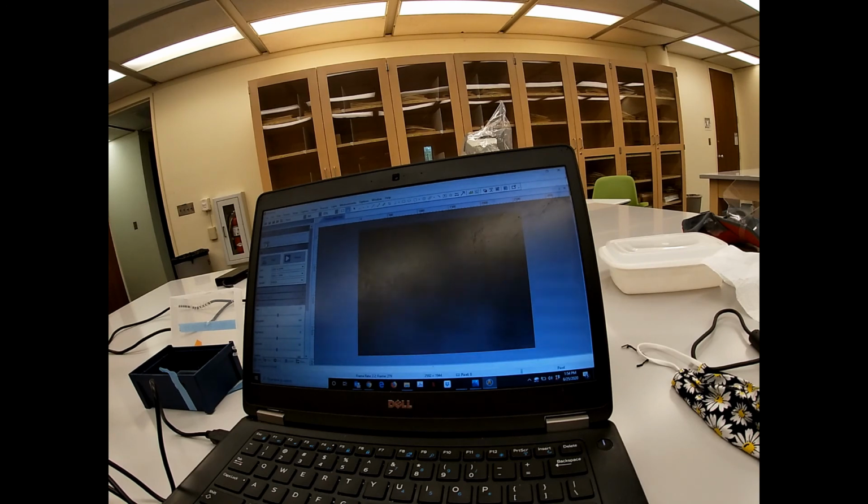I've just rotated the objective lens to the 40x, and we're going to let that come into focus. The camera's working. You're going to see it's going to be a little bit blurry. So you're going to have to use your fine-tune focus. Oh, and we don't even have one here. So I'm going to have to move my stage arm to bring one into central view, because the camera's much more limited in its view. Oh, isn't that just beautiful? Oh, nope, I just lost it.